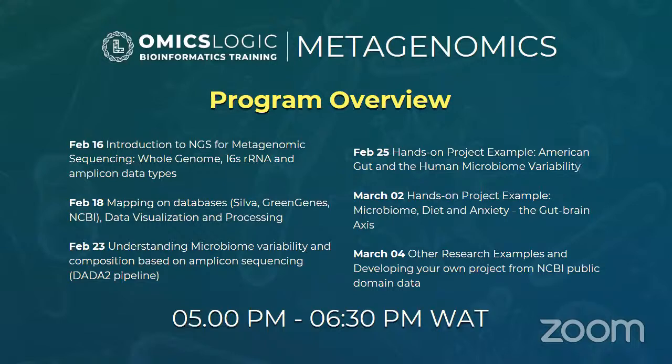Other than that, the program will cover main aspects of metagenomic sequencing, analysis of 16S RNA, and other aspects of microbiology research using bioinformatics. In these sessions, we will have hands-on experience using the TBioInfo platform, and also practice through our Omics Logic platform.